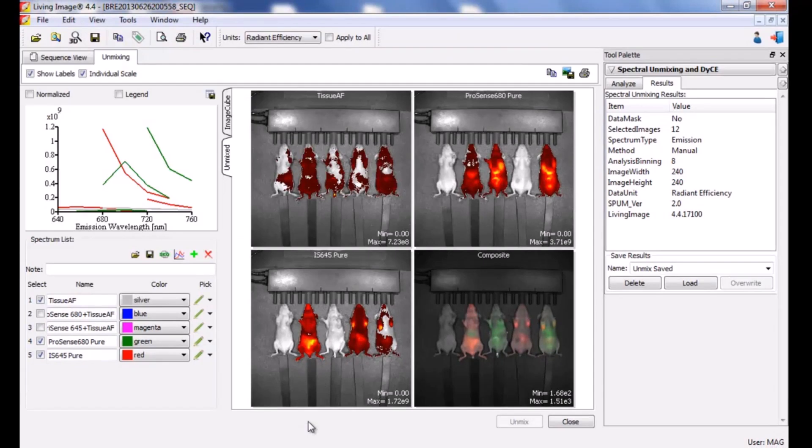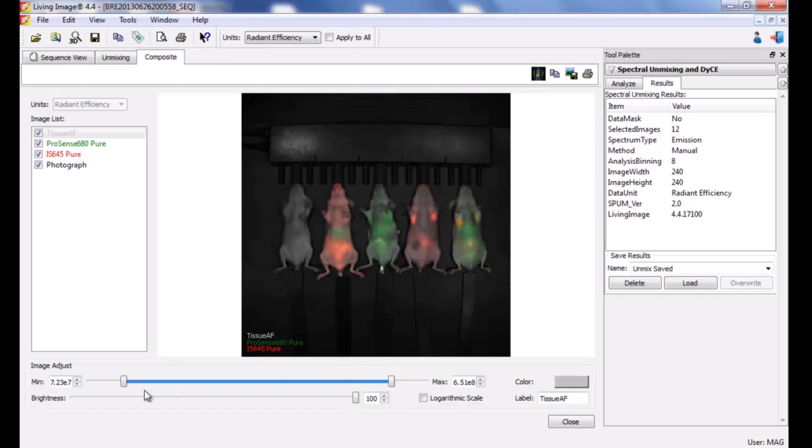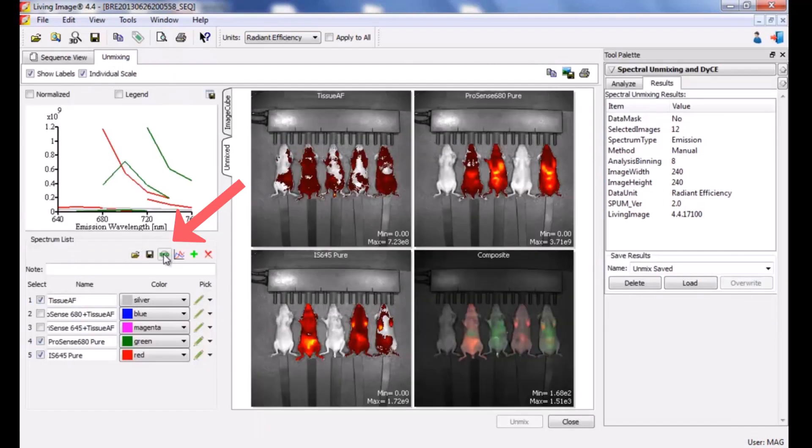You will be presented with both quantitative and qualitative output. For quantitation, the three unmixed components are represented with color maps in the first three windows. There is one image for each pure component. The final window is a composite that includes all three individual components superimposed, each pseudo-colored based on the selection in the spectrum list area. To adjust the visualization of the composite image, double-click on the image. The brightness min and max and color can all be adjusted at the bottom. This view blends pixel intensities so any pixels that contain a mixture of components will be blended colors. You can copy and paste this image, however we cannot quantitatively analyze this image.